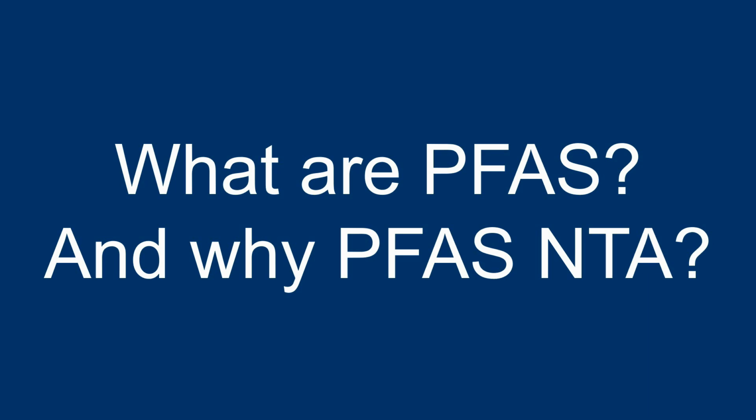This is the first video of many videos in a tutorial on how to do non-targeted analysis for PFAS. In this video, we're going to discuss what PFAS are and why we need this special method called non-targeted analysis using mass spectrometry to be able to detect all of the PFAS chemicals in our environment.